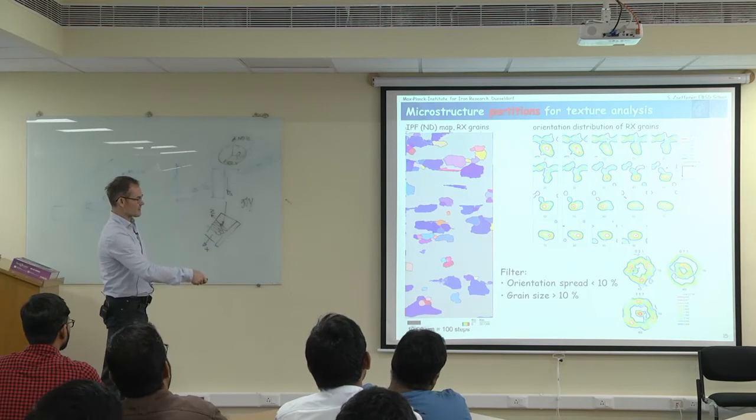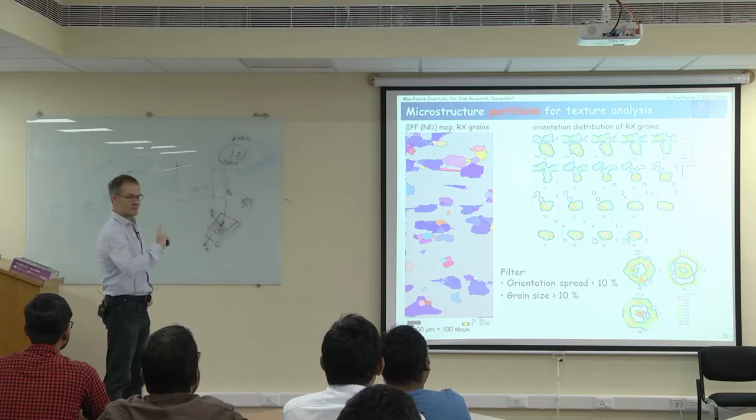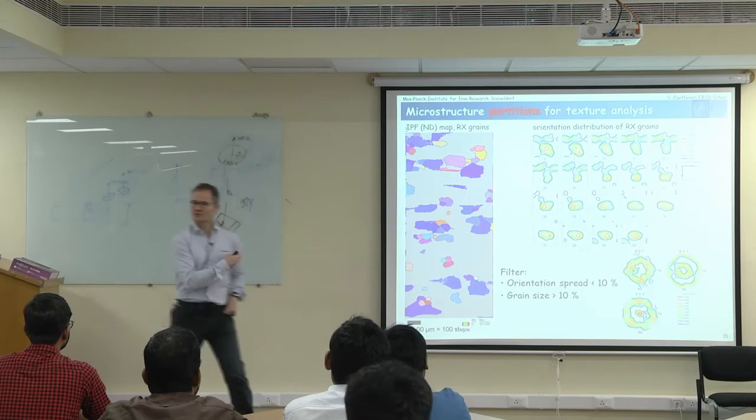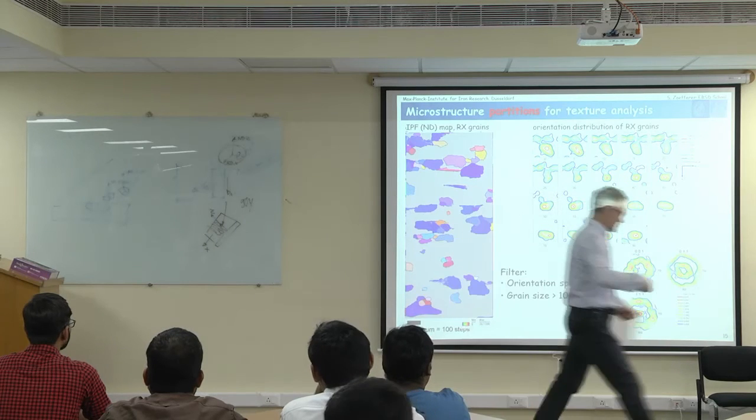And we will see, oh yeah, and this is now important. Out of this texture, we are calculating the pole figures. And now you can apply nicely your knowledge about pole figures. Who wants to come to the board and explain to us? No, I don't do that. But I will explain it to you.